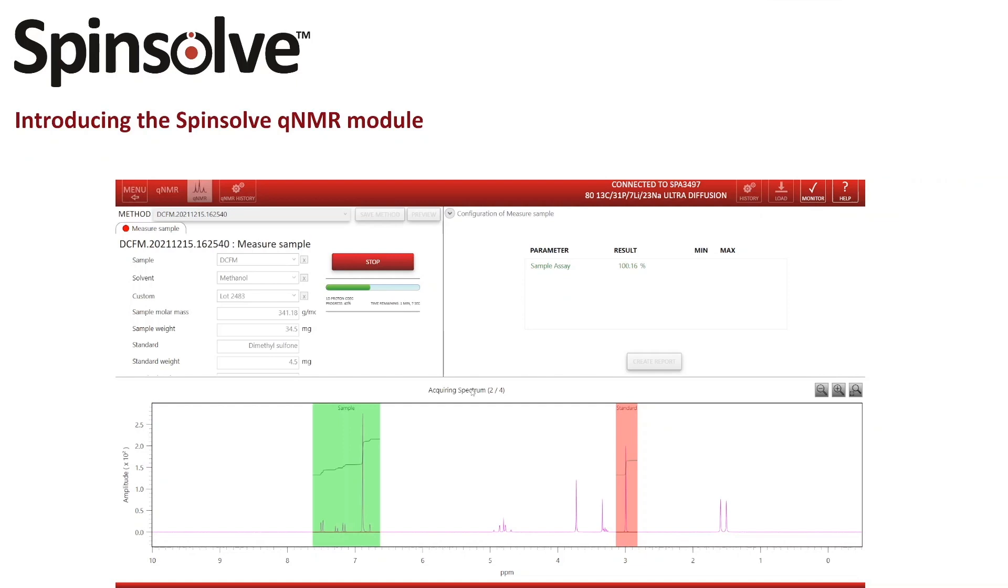The QNMR module is also fully integrated into the Spinsolve user management and audit module, so that you can restrict the level of access for different methods to different users or groups, and everything a user does is documented in ISO-conformed ways.